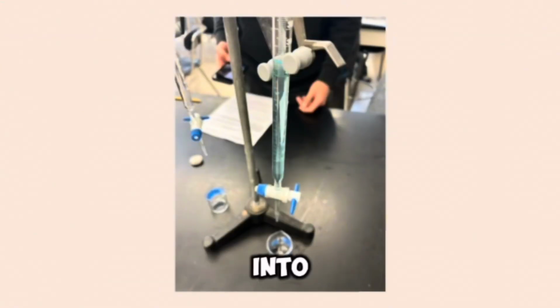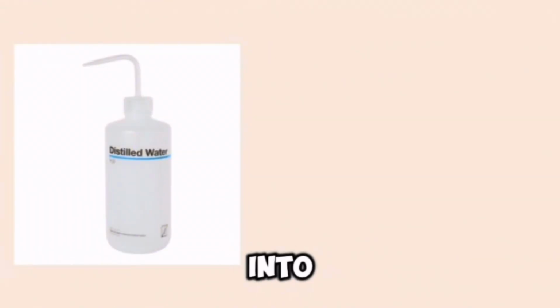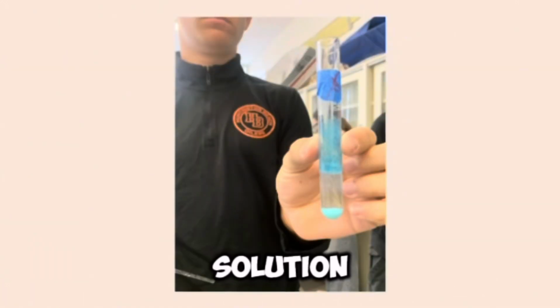To start the lab, we dispensed 5 milliliters of copper 2 sulfate in each of the test tubes. Then we added 1 milliliter of potassium hydroxide into test tube 1, 2 milliliters in test tube 2, then followed the pattern up to the 8th test tube. Then we added distilled water into each test tube in order for all of them to have a 13 milliliter solution.